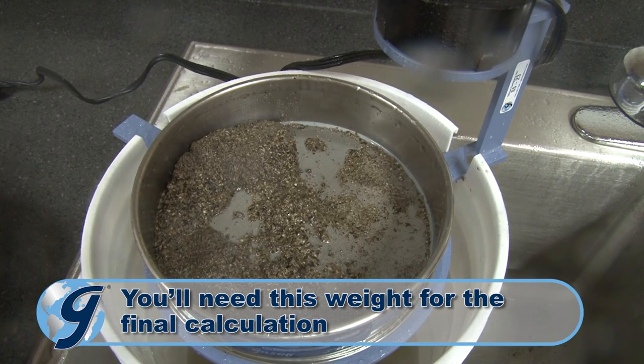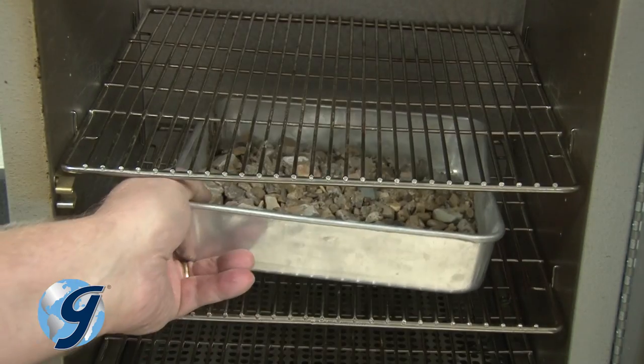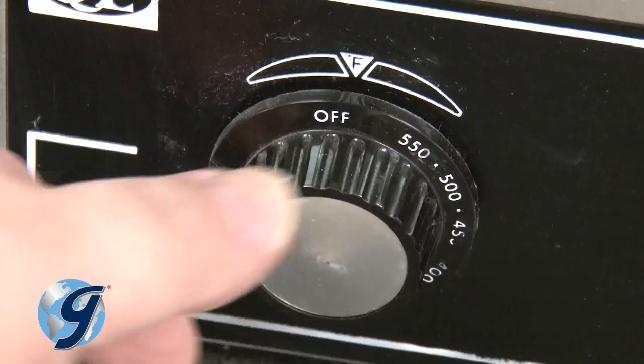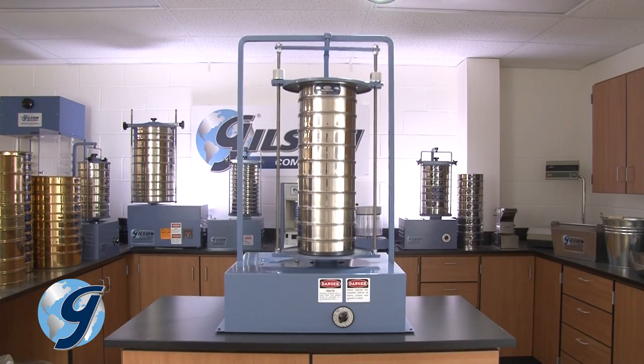Once wet sieving is complete, the retained material is placed into an oven for drying. Now separation can continue as a dry sieving test.